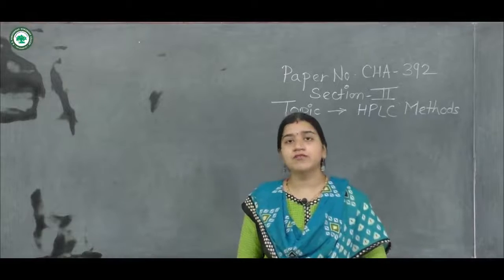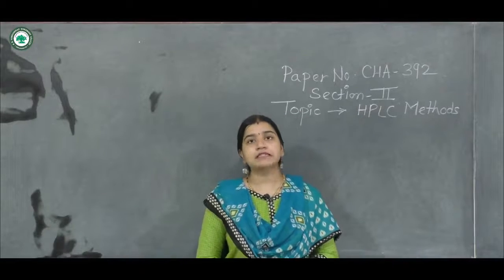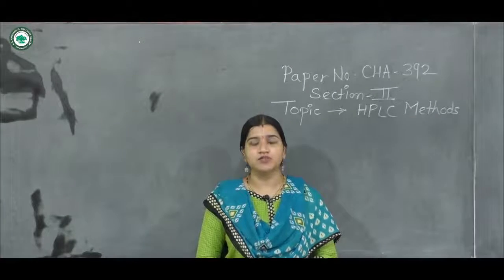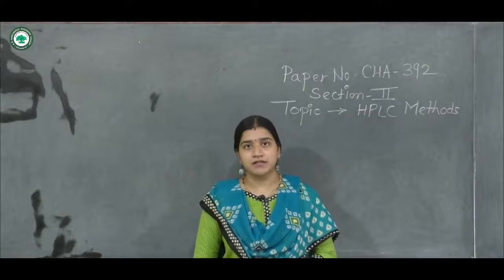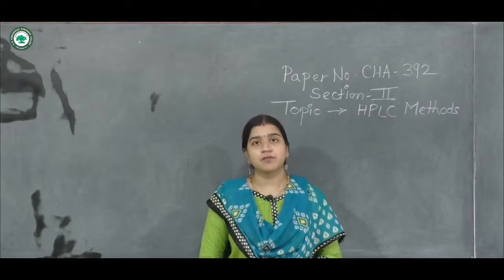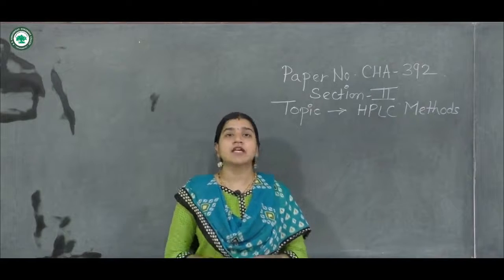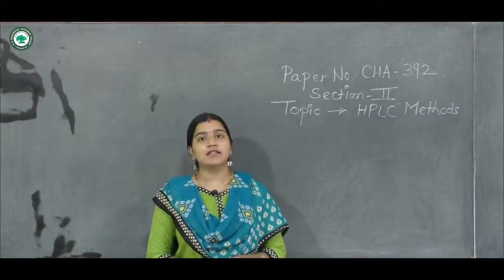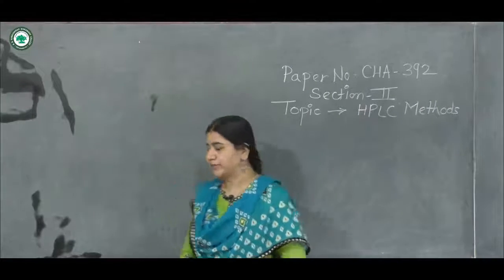Now we will begin with the new topic from section number 2 of paper number 3 CHA 392, that is the HPLC method. In the topic HPLC method, we will discuss 5 subtopics. What are these subtopics? The first one is adsorption chromatography.